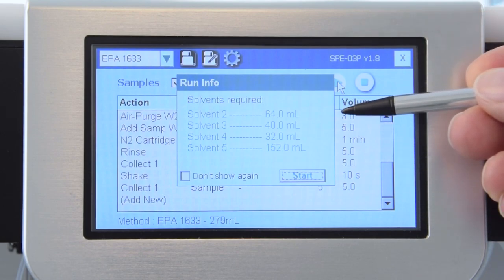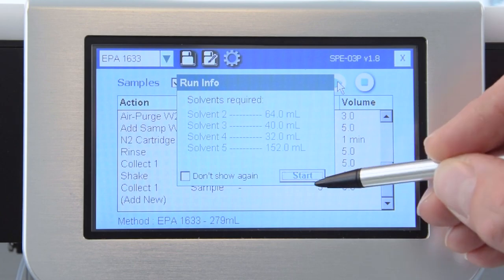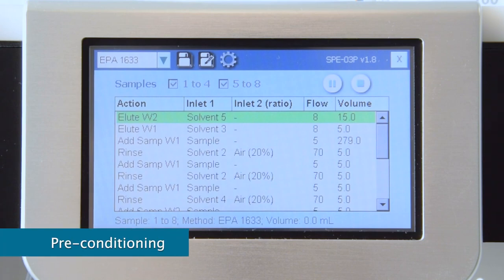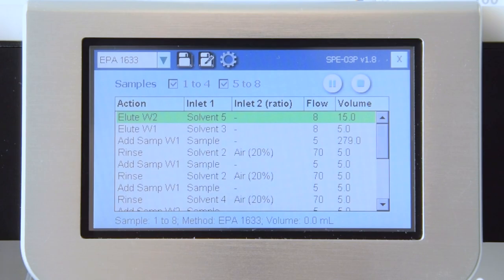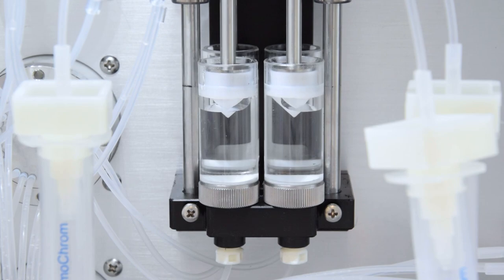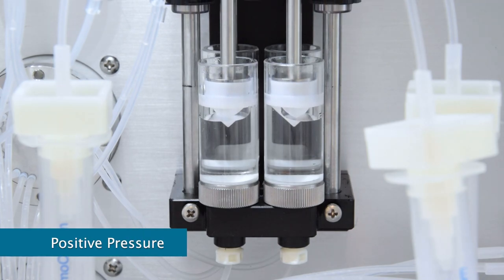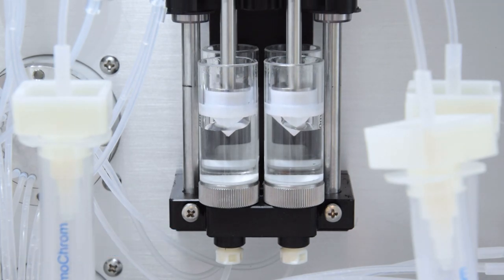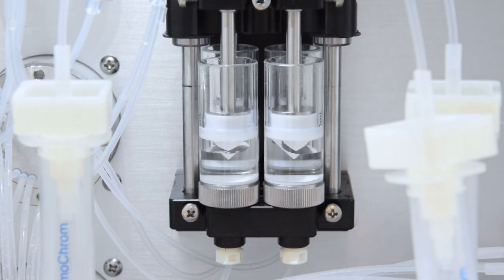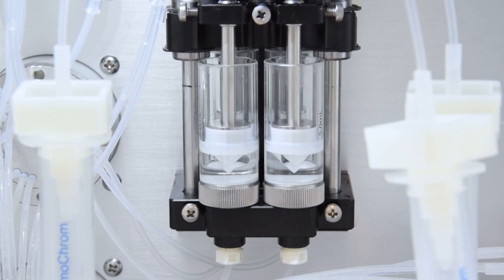At this point, the interface reminds you how much of each solvent will be consumed, so you can ensure that there is enough in each solvent bottle. I can see that the first conditioning step is now highlighted in green, and solvent 5, which is assigned to 1% basic methanol, is being delivered through the SPE cartridges. How is this achieved? If you look behind the SPE cartridges, you'll see two positive pressure syringe pumps, each containing four syringes that all push the solvent through at the same programmed flow rate. The multi-channel valve directs liquid between the solvents, cartridges and samples.